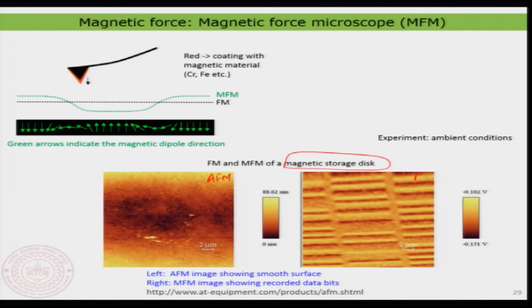But this is actually the MFM, the magnetic force microscopy, and there you see that these little features are showing the different domains that you create in order to basically store the data. You can also see the width is actually varying. This is moderately wide, and here you can see it is really wide. Yeah, there are some which are moderately wide and so on.